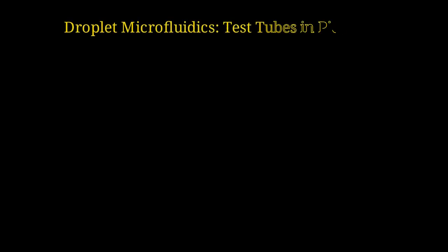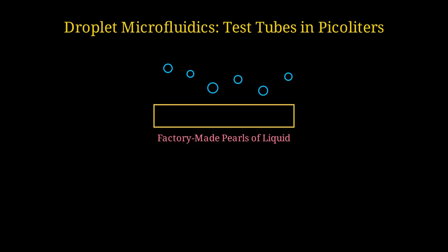Welcome to the fascinating world of droplet microfluidics, where we create test tubes the size of picoliters. Think of droplet microfluidics as creating factory-made pearls of liquid. Each droplet is a tiny isolated reactor, perfectly uniform and controlled.